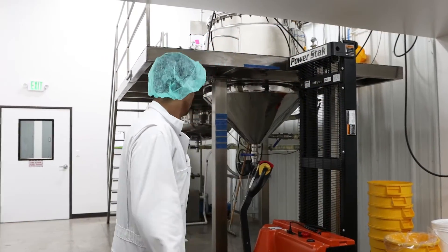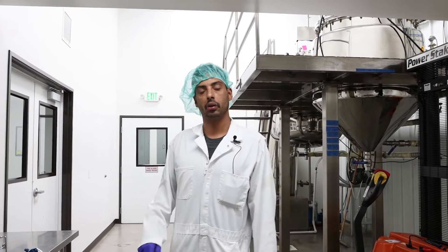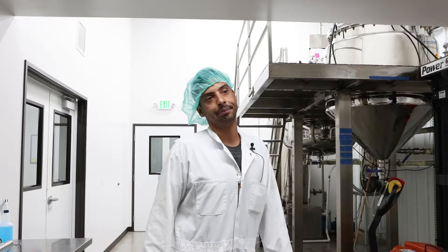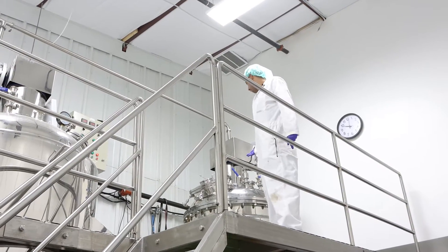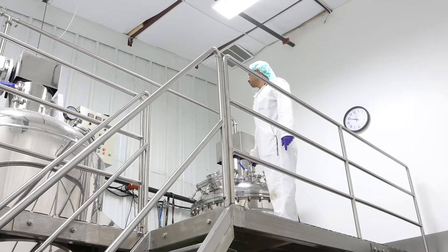At that point, we will start our vacuuming pump process. We have several satellite tanks in the other room right now that are kept warm to 60 degrees Celsius — the best temperature for gel to be stored at for a good amount of time. So right here we have our gelatin mixer, roughly 300 gallons capability.